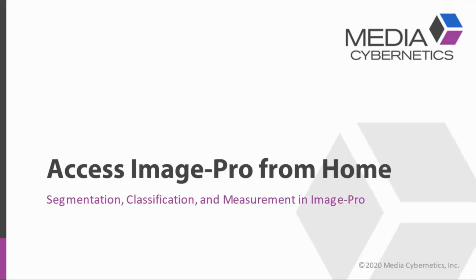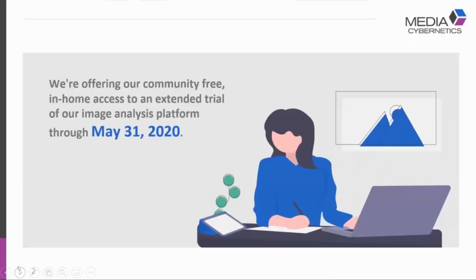Today is the second in a series of webinars, and we're very excited to talk about our new extended trial of Image Pro. On our next slide, I want to let you know that we're offering a new free community version that is extended, offering our image analysis platform through May 31st, 2020. Obviously, with all the technical and economic hardships that we're facing right now in the world, we felt it was very important for us to help in every possible way.